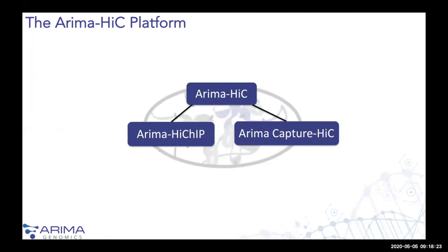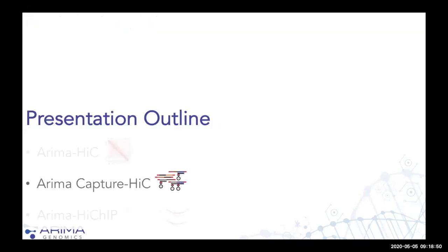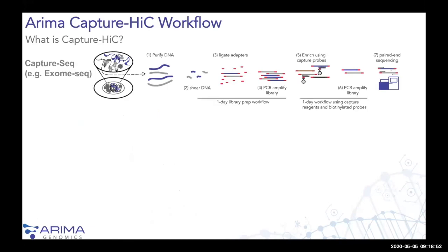Now, with that introduction really to the Genome-wide Hi-C, as a company, we've been really, I think, keen to address more targeted tools that are well positioned to address specific targeted hypotheses when it comes to genome organization, gene regulation, and those two tools, like I said, are called HiChIP and Capture-HiC. And I really only have a time to just barely touch on both of them. And I'll start with Capture-HiC.